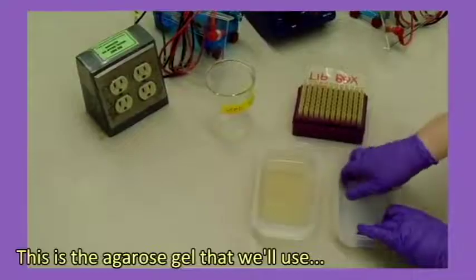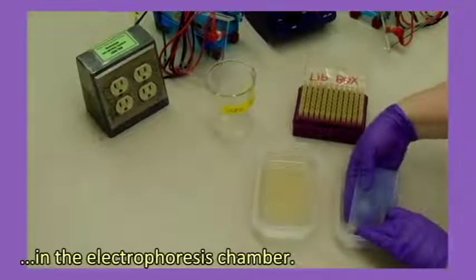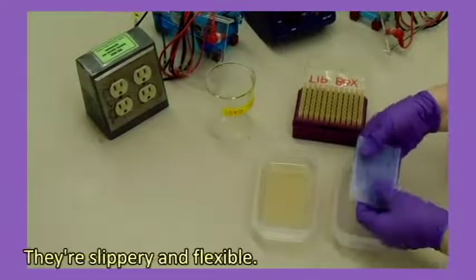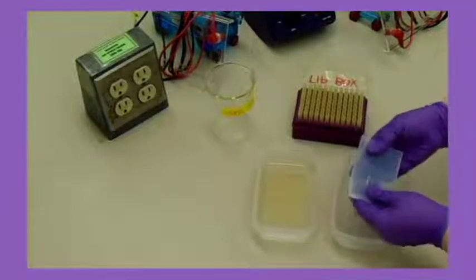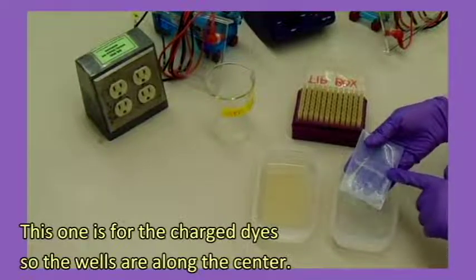This is the agarose gel that we'll use in the electrophoresis chamber. They're slippery and flexible. This one is for the charged dyes, so the wells are along the center.